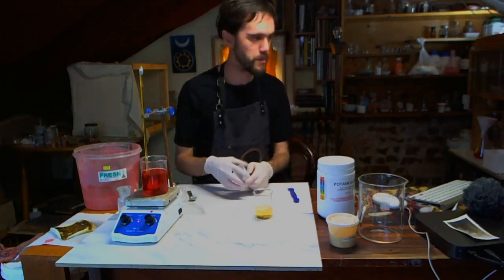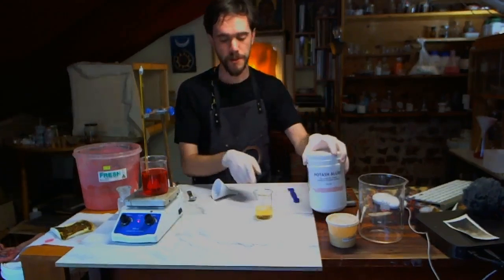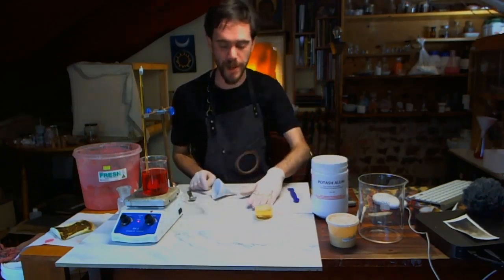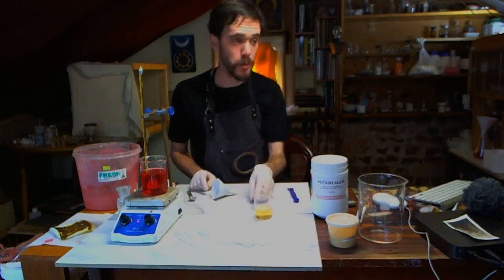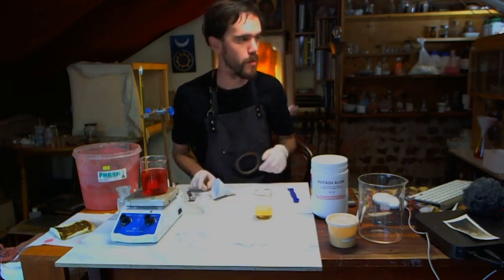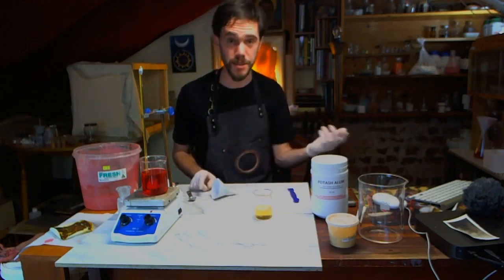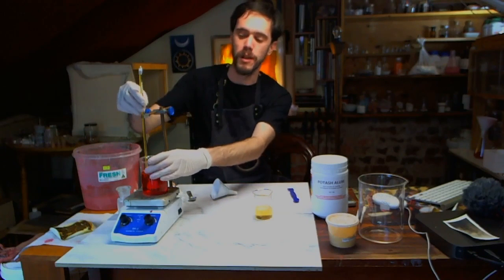Alright, so this next step, what's going to happen is, because potassium alum is potassium aluminium sulfate, and lead acetate going in, the lead will react with the sulfate part and produce lead sulfate that's insoluble, so that should drop out of solution and we should have some white lead sulfate at the bottom. And I don't know what happens to the acetate, which is interesting. But then, boil the lead into the acetic acid until it dissolves. Yes. And then once the lead has dissolved in the acetic acid, you can boil it down and evaporate it until you get your lead acetate crystals.